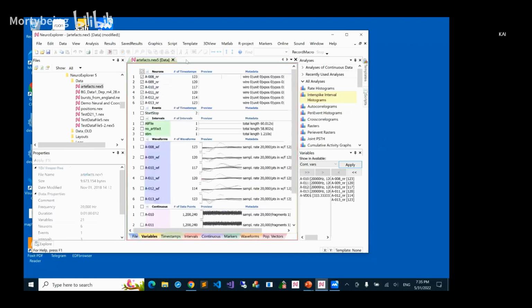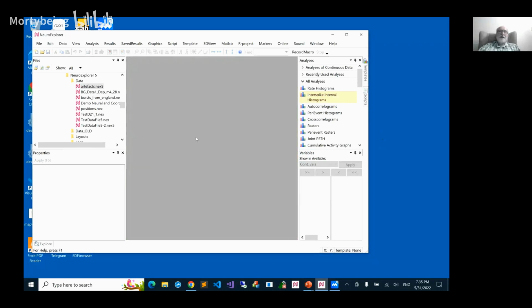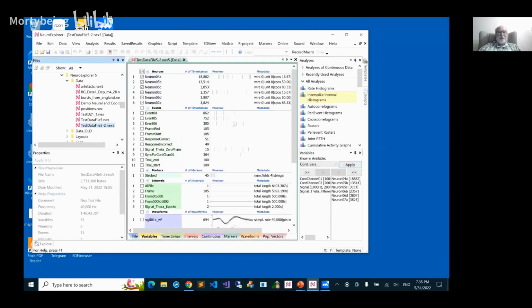Yeah, welcome. Okay, so now I actually started writing this presentation with actual spike train analysis, and I was thinking this is a tutorial on how to analyze data, not how to use NeuroExplorer. But I have this series of steps.